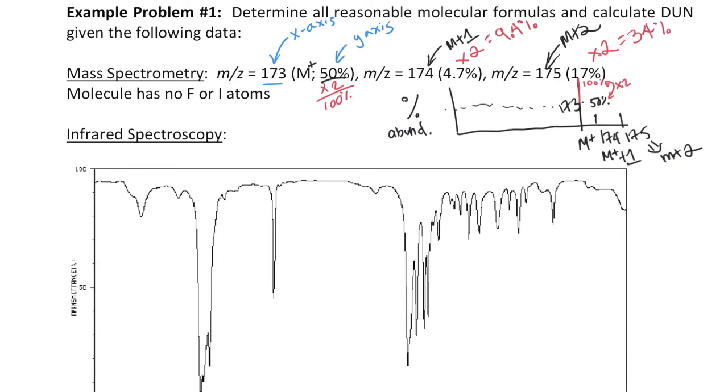Okay, so we did this. If you look at the checklist, we looked at M, we scaled everything to 100%. We're not done with M. Once we have M, I'm going to highlight M right now. Here's my M value. So we scaled it to 100%, so that part's done. What else do we need to do with M?